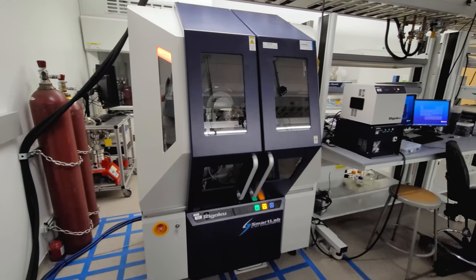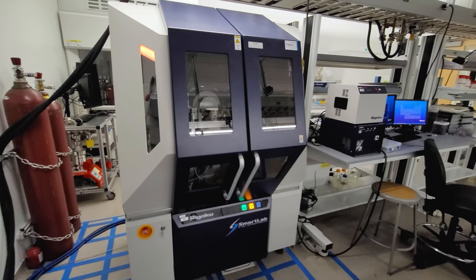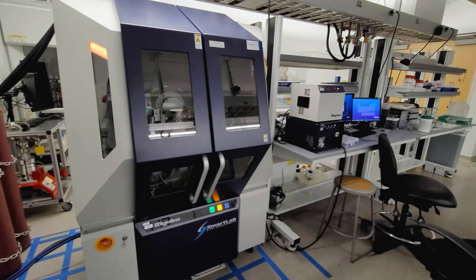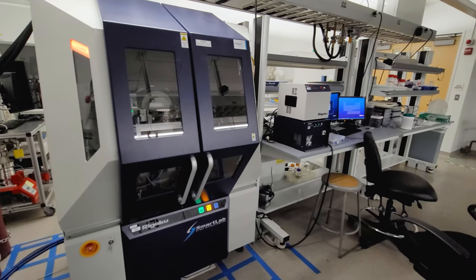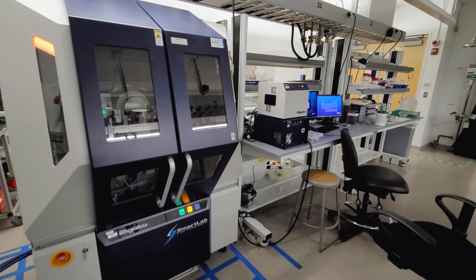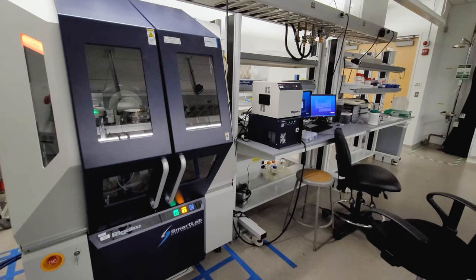X-ray diffraction allows us to evaluate the crystalline nature of the materials to verify we have grown the correct phase, the phase purity, temperature-dependent properties up to 1000 Celsius, determine the orientation of the crystallites on the substrate, verify heteroepitaxial growth, and measure the thickness with nanometer precision.